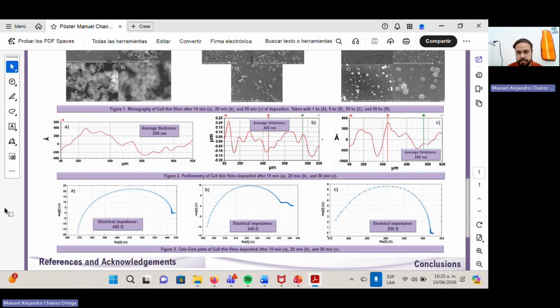So observing an impedance decrease in these Nyquist plots as the chemical bath deposition was carried on, with an increase in the homogeneous deposition of the thin films, leads us to support our morphology results or micrographs with the electrical impedance spectroscopy measurements obtained with this method.